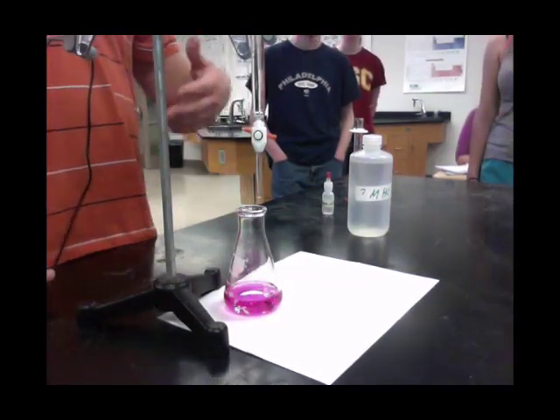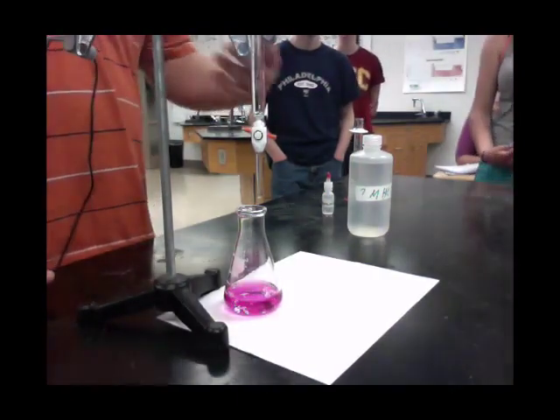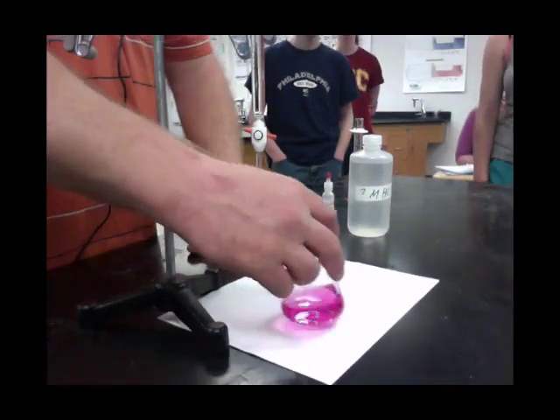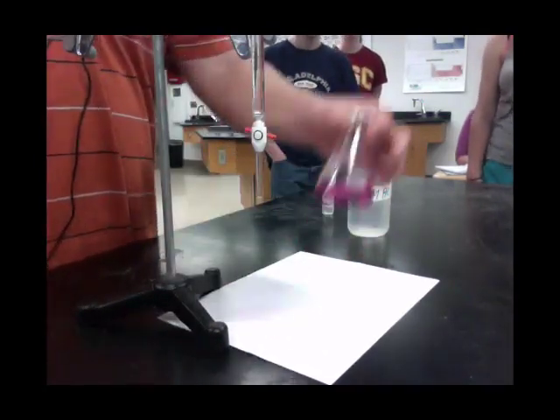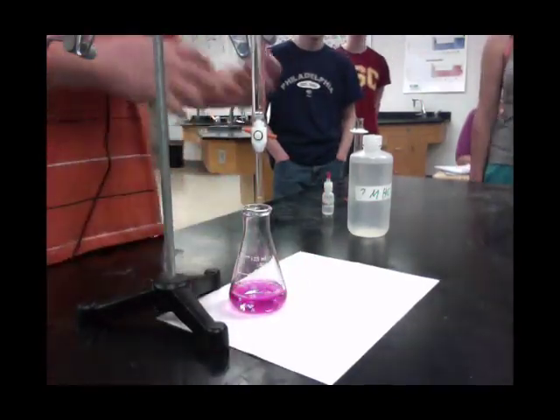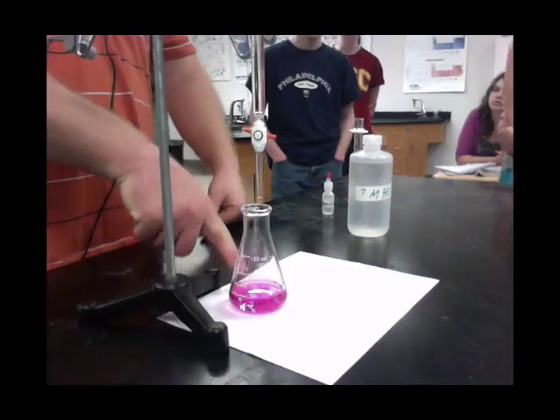Tomorrow you guys are going to run this at least three times, so everyone gets at least one chance at doing it three or four times. If you overshoot one, that's fine — you'll clean and rinse your flask and then redo it. The goal is to get as little pink as you possibly can in here.